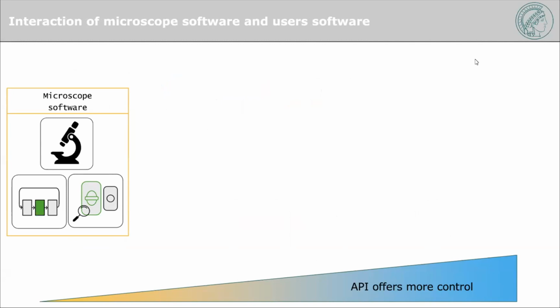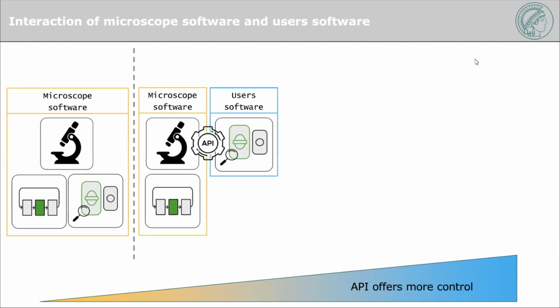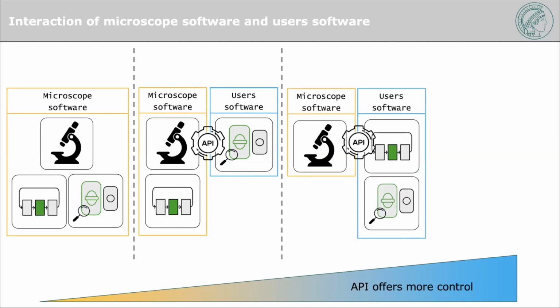But if there is a little bit of code or tools that are available, we may outsource some of the tasks. The first task we may want to outsource is the image analysis, to be able to do maybe more complex tasks, or reuse the workflow that we already programmed and use it again on different microscopes.